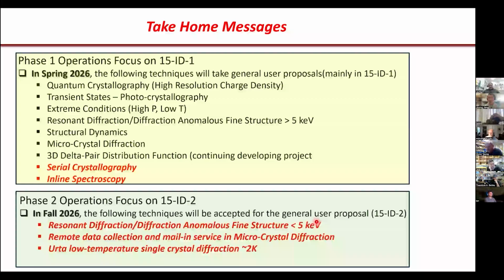That's our goal, right? Because we have a large, tunable energy range, and also we have a lot of diffractometers, and then we try to get it. We have different kinds of detectors, so it would be nice to see how we can fit everything to our user community. That's a goal for the ChemMatCARS.